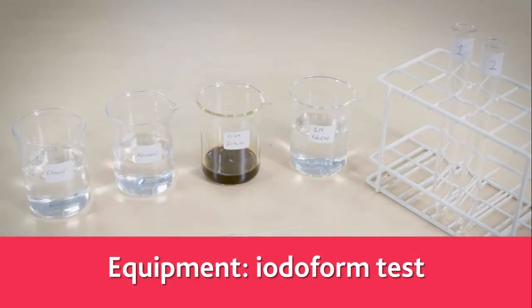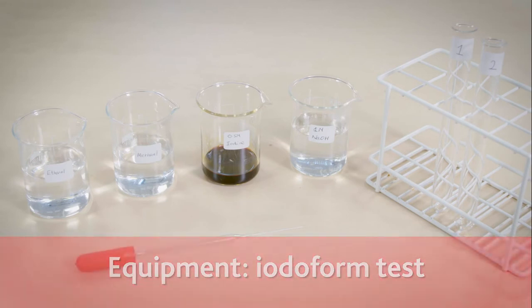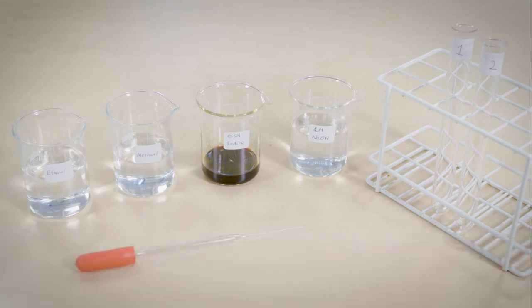The iodoform test can be used to identify the presence of a methyl carbinol group in alcohols. If this group is present, the precipitate triiodomethane is produced.